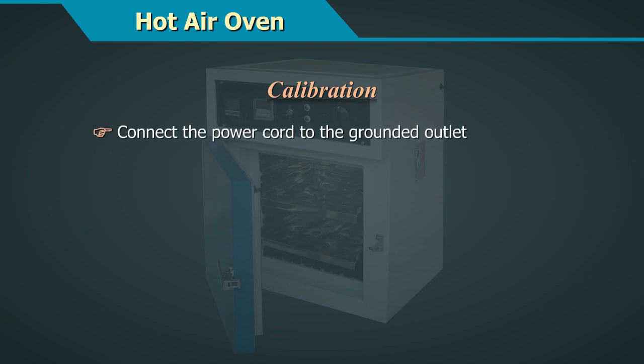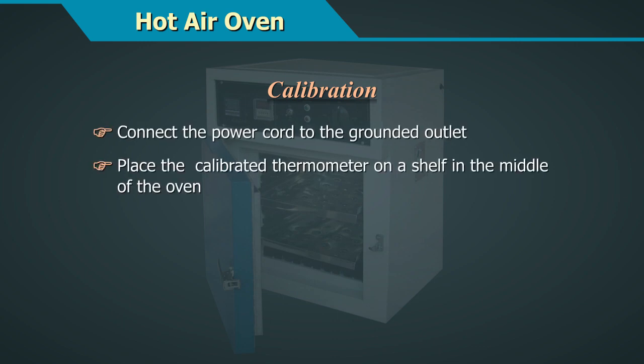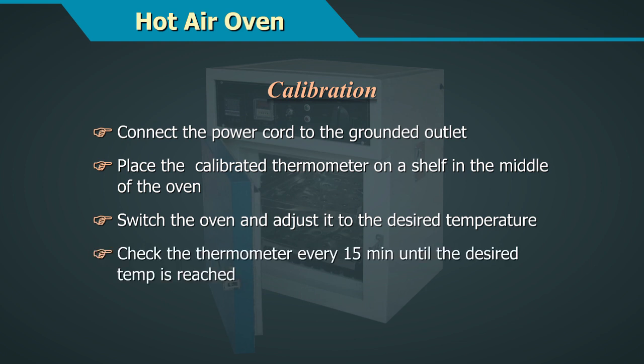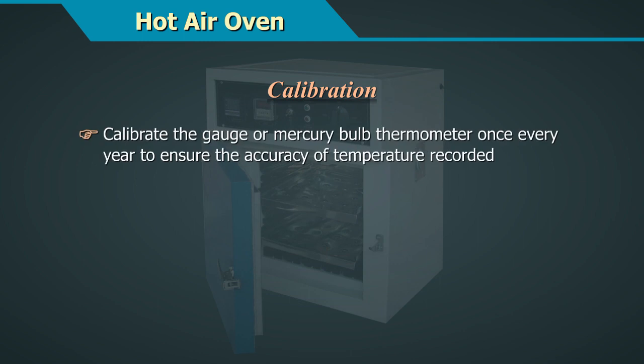Calibration: Connect the power cord to the grounded outlet. Place the calibrated thermometer on a shelf in the middle of the oven. Switch the oven on and adjust it to the desired temperature. Check the thermometer every 15 minutes until the desired temperature is reached.